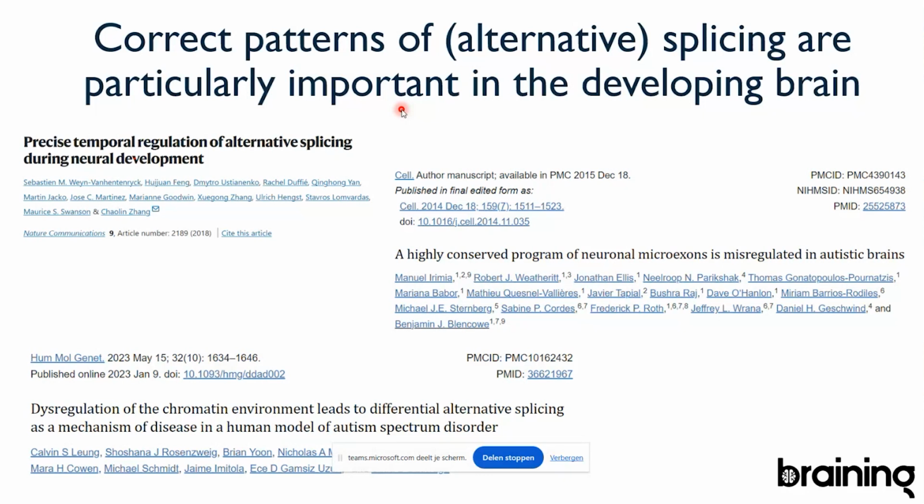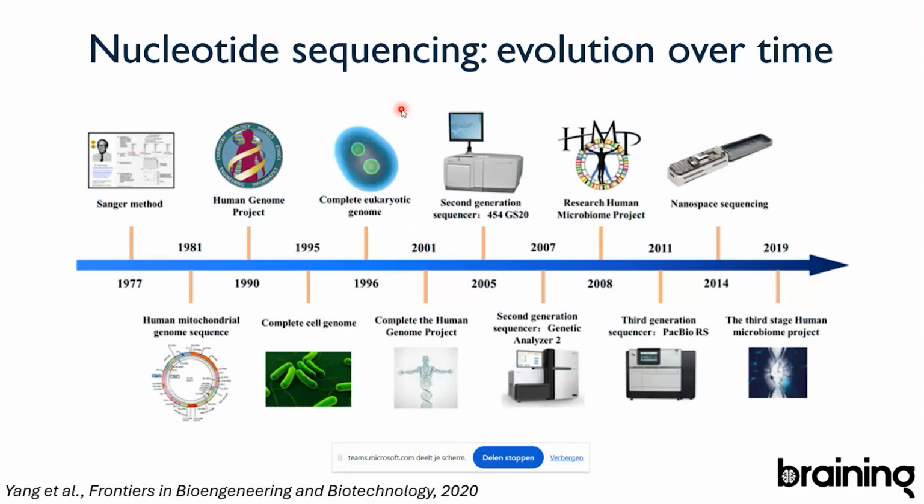So generally, as I told you, DNA molecules and RNA molecules are very interesting for us biologists to study. And the way to study them is to do sequencing, right? And sequencing is essentially determining the order of bases in a given RNA or a DNA molecule. And here I give you a brief overview of all the developments in sequencing that have been done since 1977.